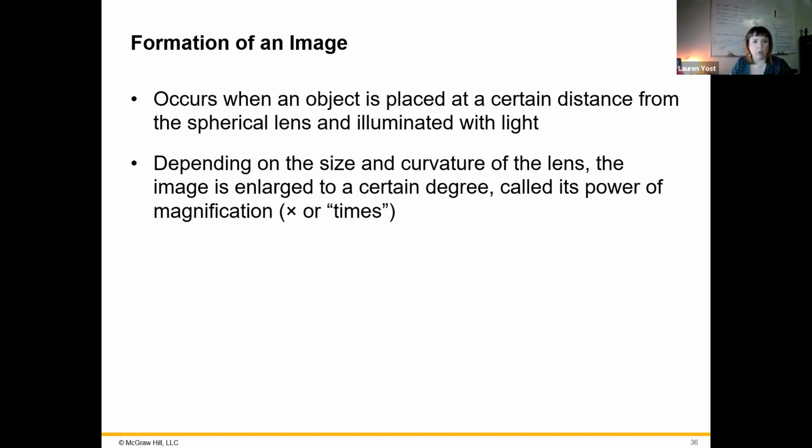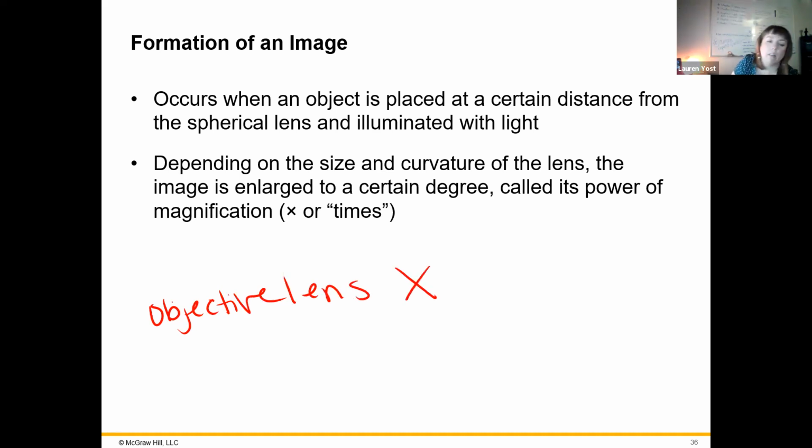Typically, if you want to get the full magnification of whatever you're looking at, you will take your objective lens number and multiply it by your ocular. And yes, our microscopes do have these, and they do say their magnification amounts on them. So when you are asked questions about this on the test, this is not some sort of trick.